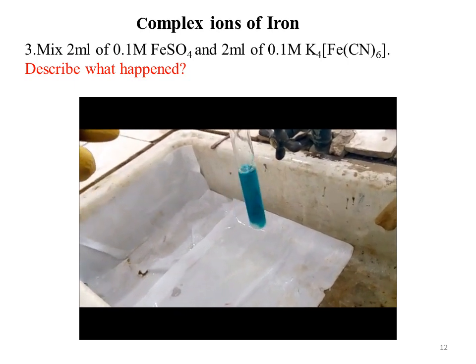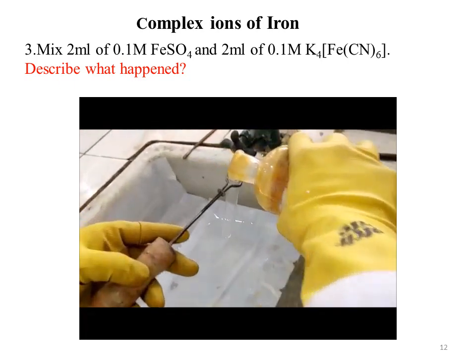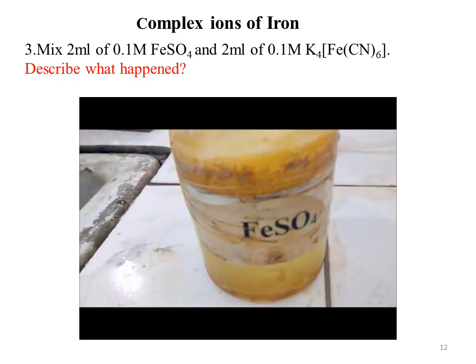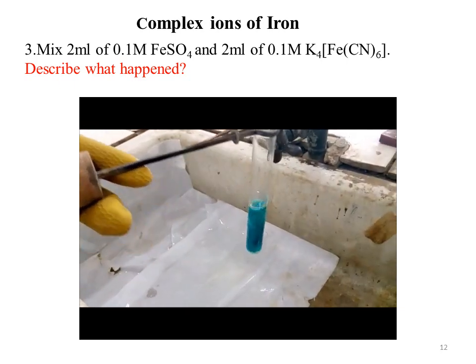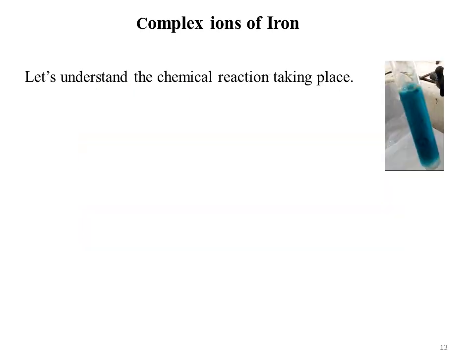The product is iron 2 hexacyanoferrate 2 complex, where this complex is appearing as Turnbull's blue precipitate. As you have seen in the last video, Turnbull's blue precipitate appeared.